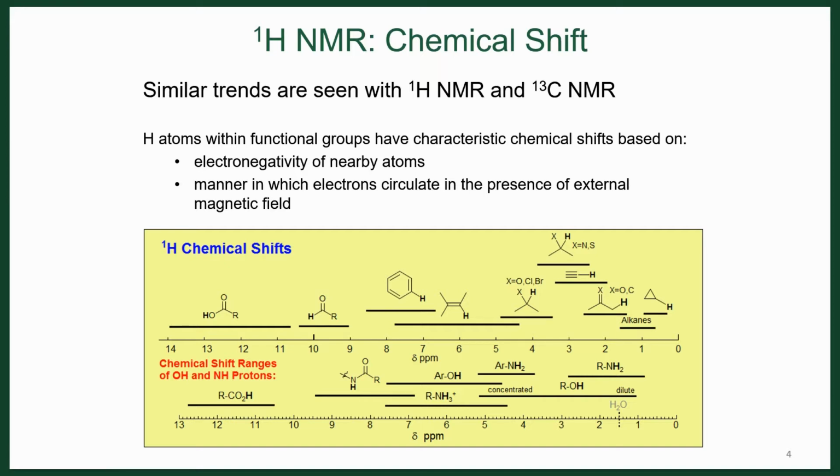So located on the slide here, we have a number of different chemical shift ranges. It's good to have an idea of where many of the sp3 systems come. The sp system sneaks into the middle of this, as well as many of the sp2 hybridized carbon-hydrogen based systems as well. And so there's kind of a clear delineation between these right around 5 ppm. And then we have these carbonyl containing functionalities as well. These are just good ranges to keep in your mind so that you can begin thinking about what types of structures are related to these types of systems.